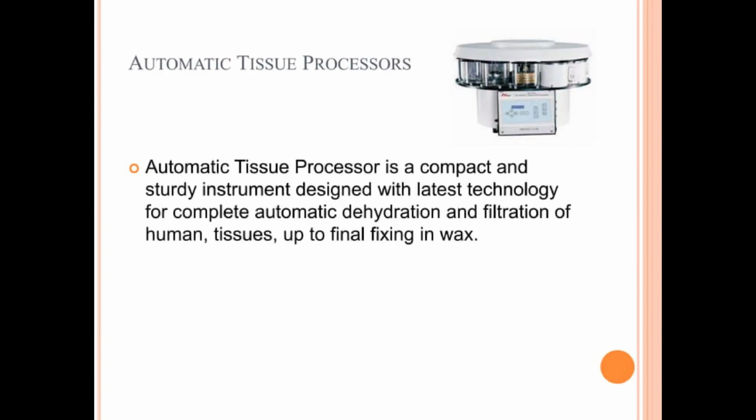An automated tissue processor is a machine that prepares tissue samples for microscopic examination by fixing, dehydrating, clearing, and infiltrating them with paraffin. These machines are used in laboratories, especially in histology, immunology, microbiology, and biotechnology. There are two main types of automated tissue processors.